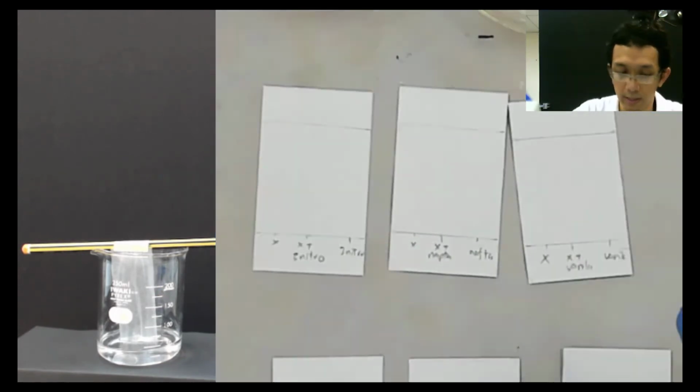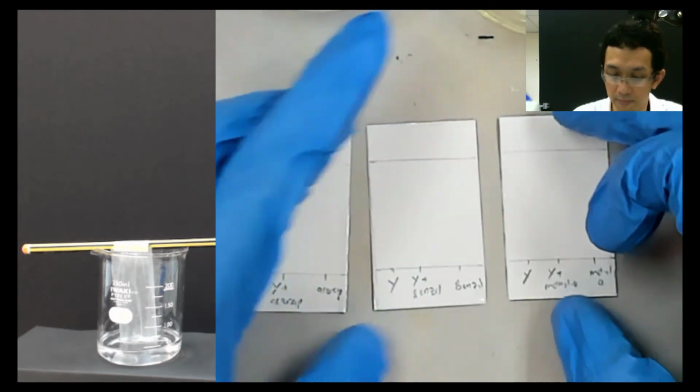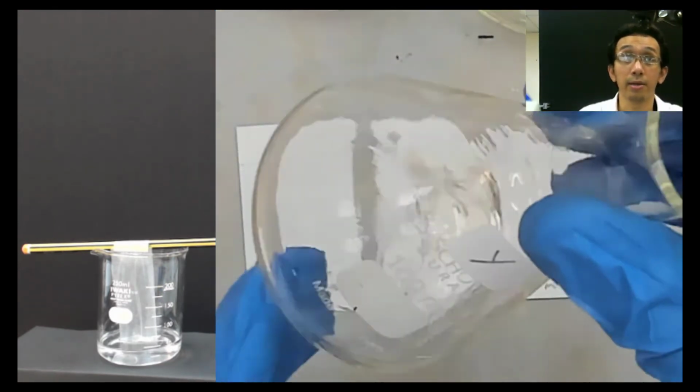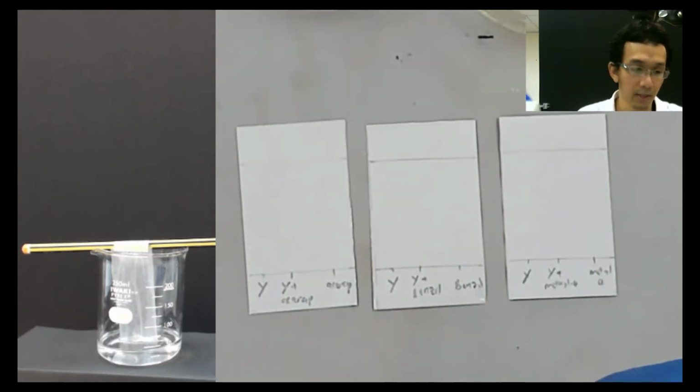So I will bring this X somewhere else so that it will not disturb my table. Okay, so this I bring up. Now that's Y. So this is Y, same as X. We do Y for all the three plates first. So take a new spotter. So I take a new spotter here.